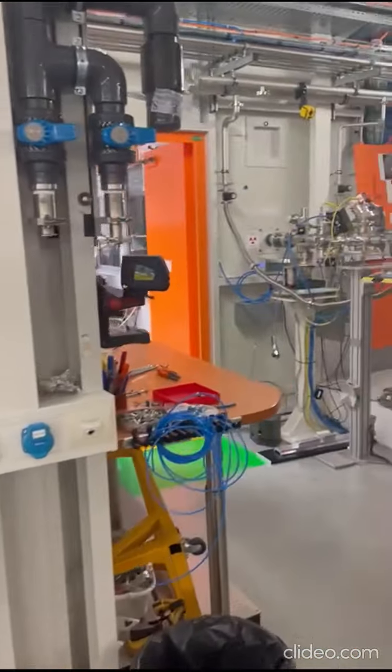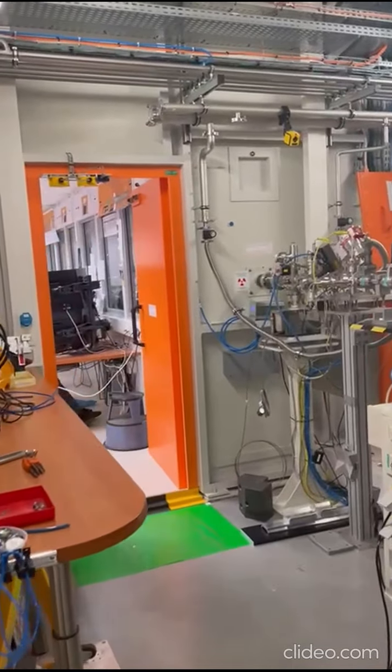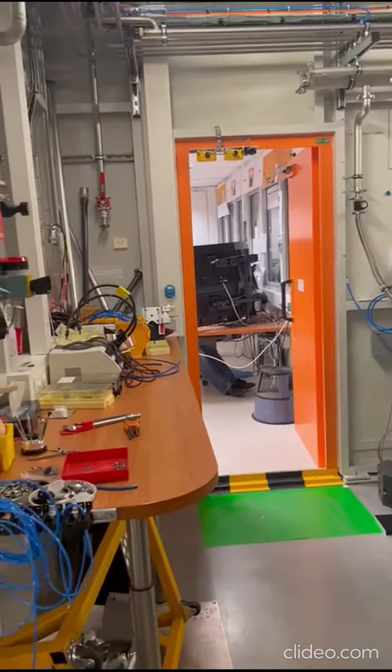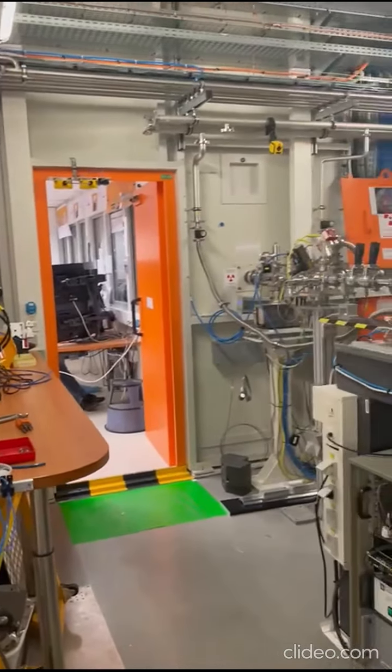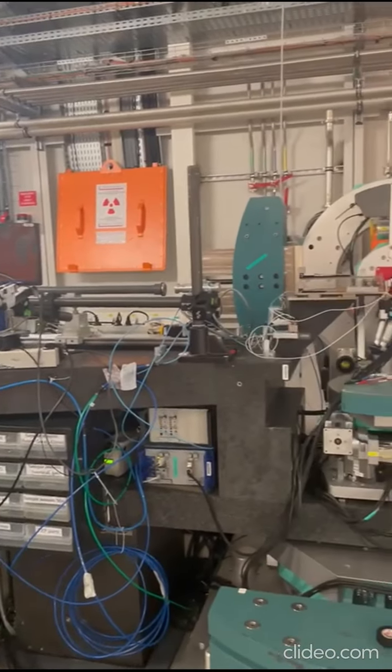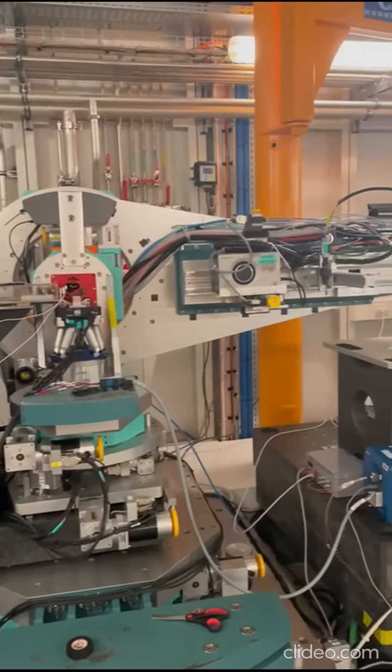And instead of using lenses for this system, computers are used to image the nanocrystals, and different software is used to position and to control these systems as well as obtain the images.